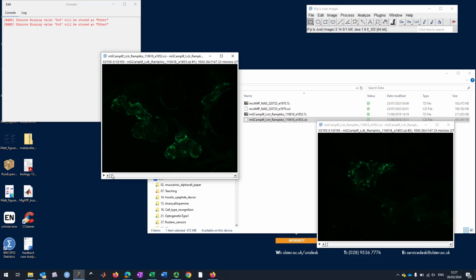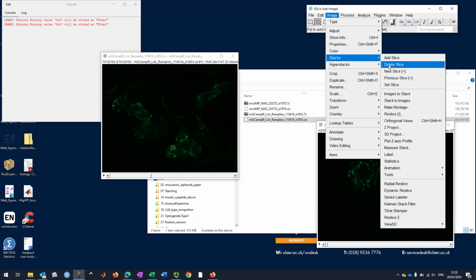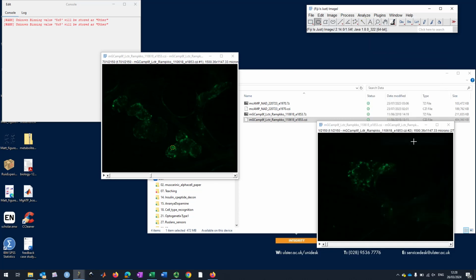You can see some green dots. At some point they spark. At some point they kind of oscillate. In order to give you a taste about the green dots, you can select this elliptical tool around that, turn around that, and then you go Image, Stacks, Plot Z-axis Profile.